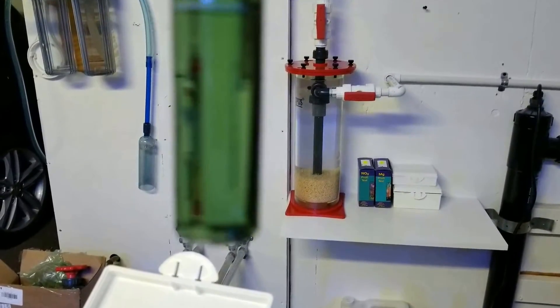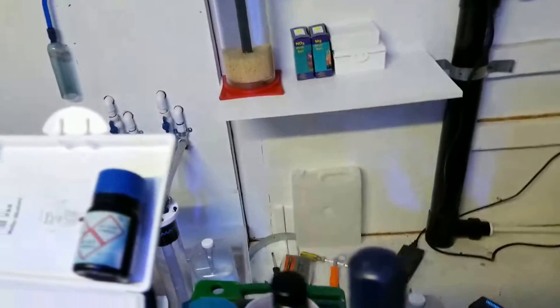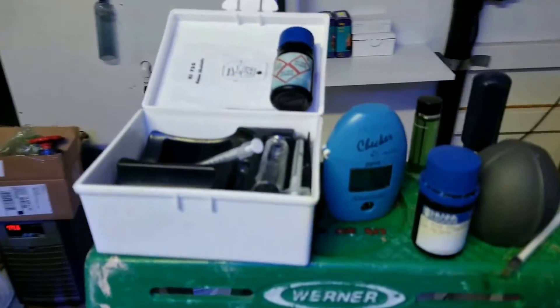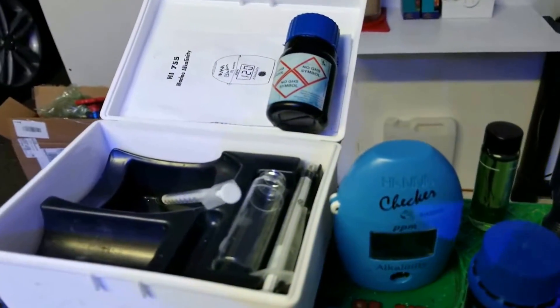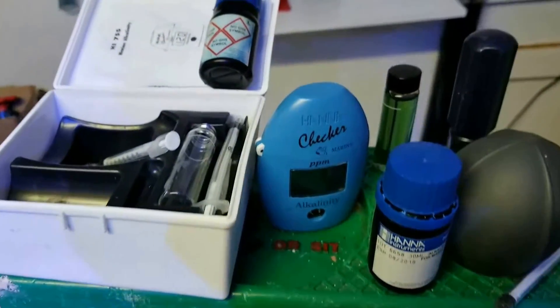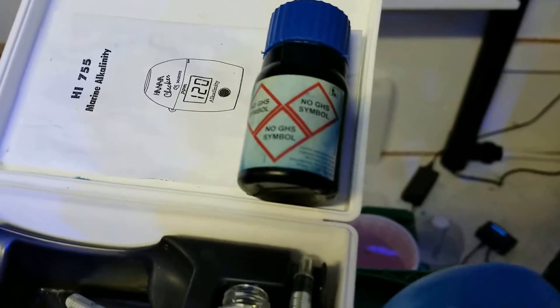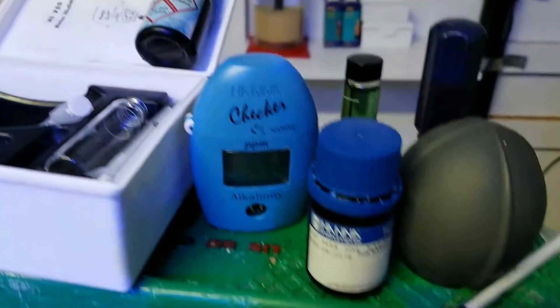When I was doing the test, I noticed the little floaties inside there. What that must be is the reagent clumping up, or maybe part of it's leaking out — it screws it up somehow, I'm just guessing. But if you see little floaties in there and your jar looks like this, don't even use it. Get a new one.